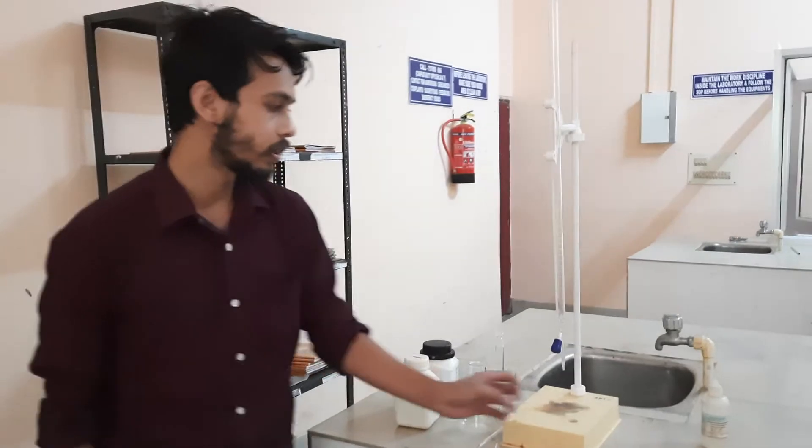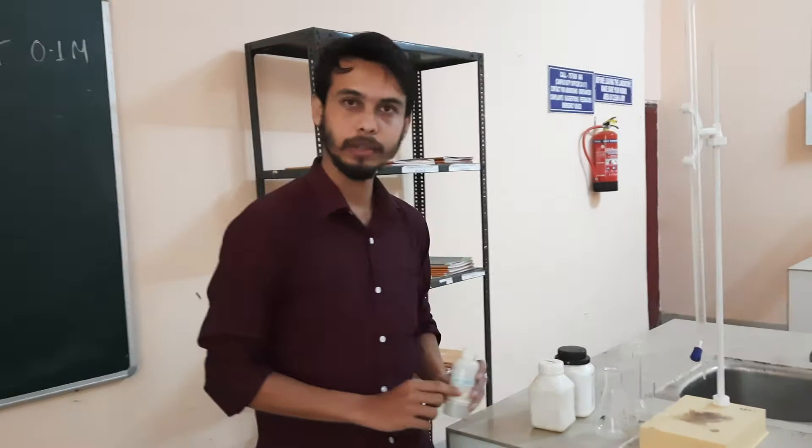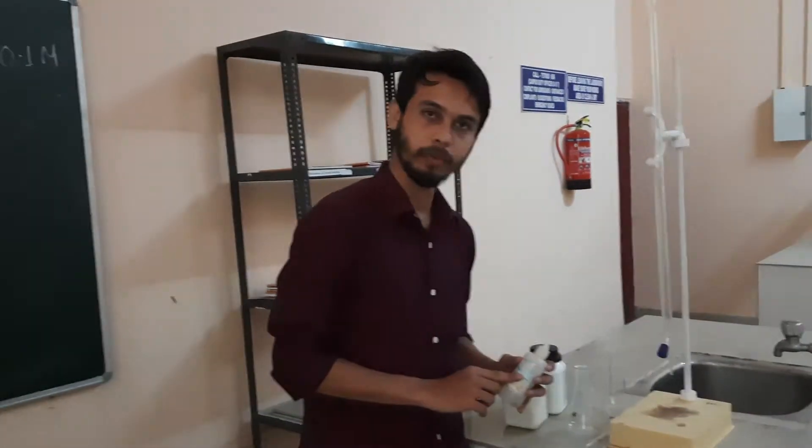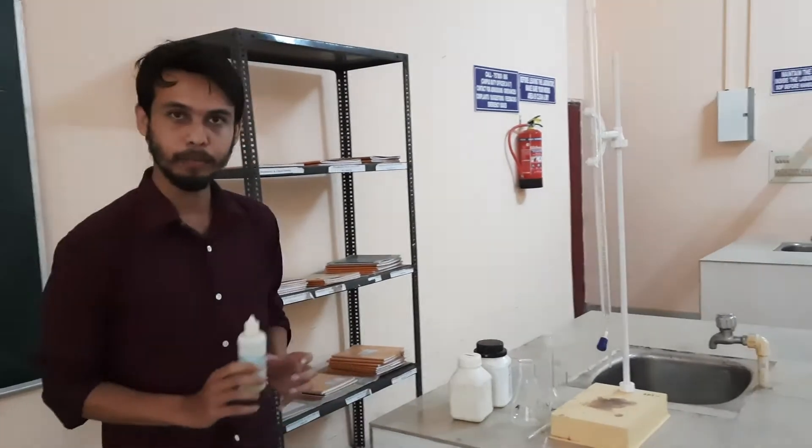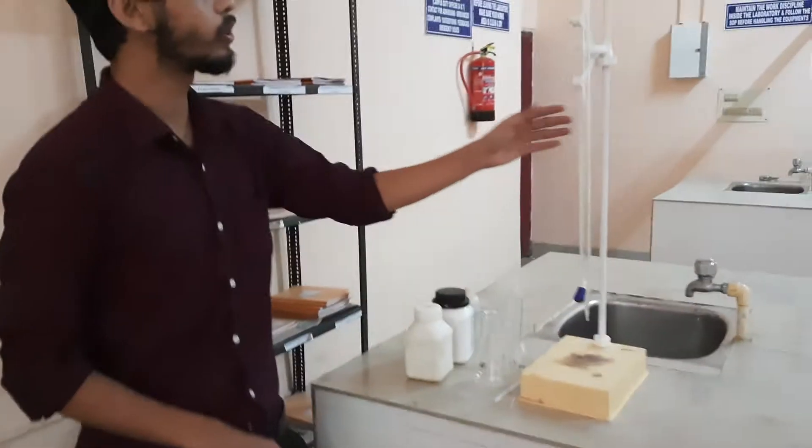Some indicators we need. There is phenolphthalein we are going to use. Because it is a titration, we need some indicators. So in this particular experiment we are going to use phenolphthalein as indicator to determine the end point. And conical flask, I am going to use this one.